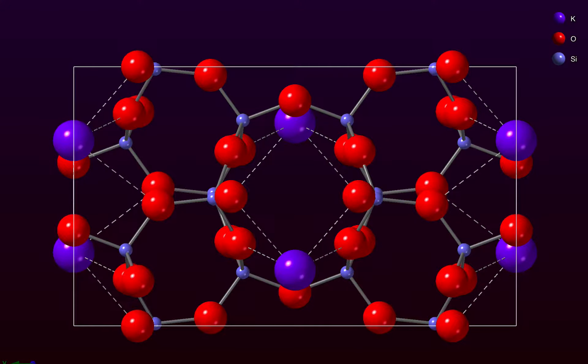Here we have an inorganic crystal framework and we might be interested in the environment around one of the atoms. Unfortunately, because it's a complicated structure, it's difficult to find out about the environments without other atoms getting in the way, but there's a quick shortcut that we can use.